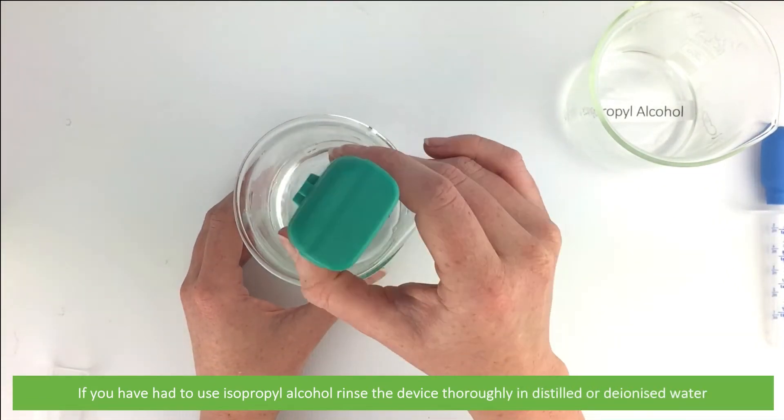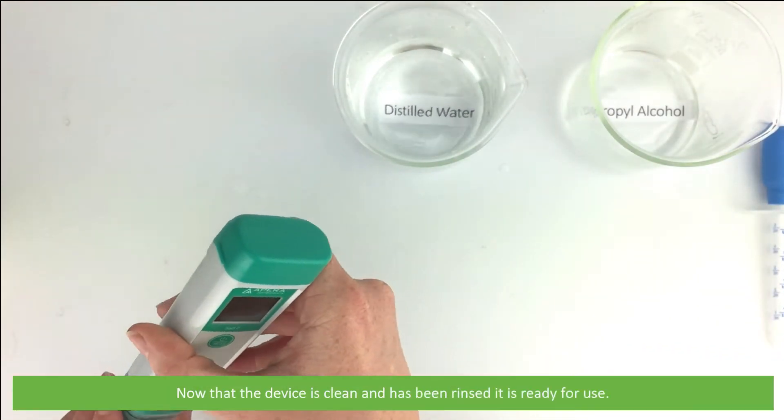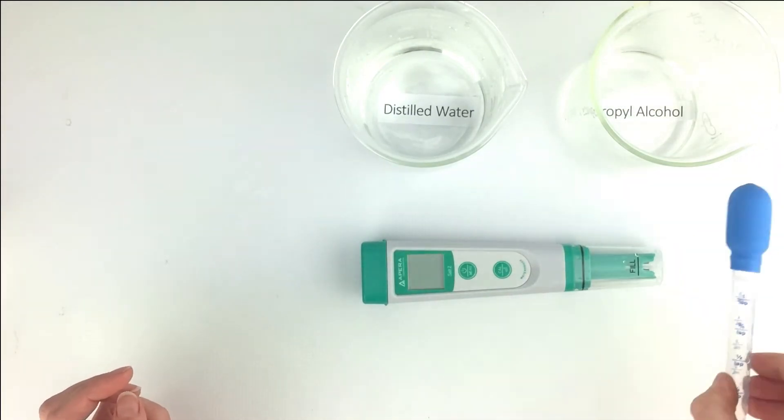Once the device has been thoroughly rinsed in distilled water, it is clean and ready for use.